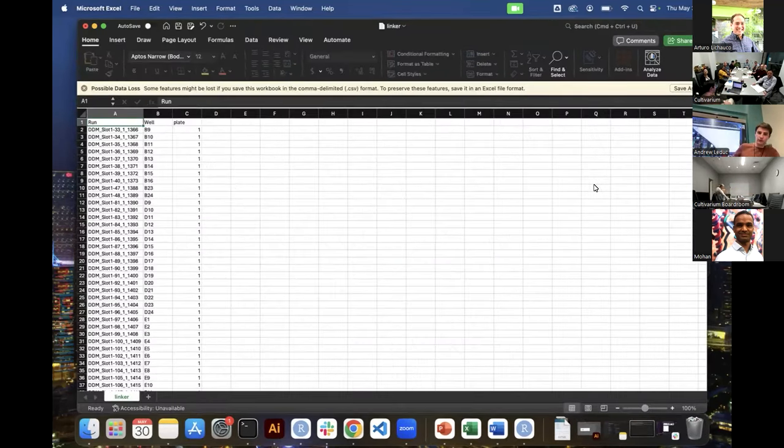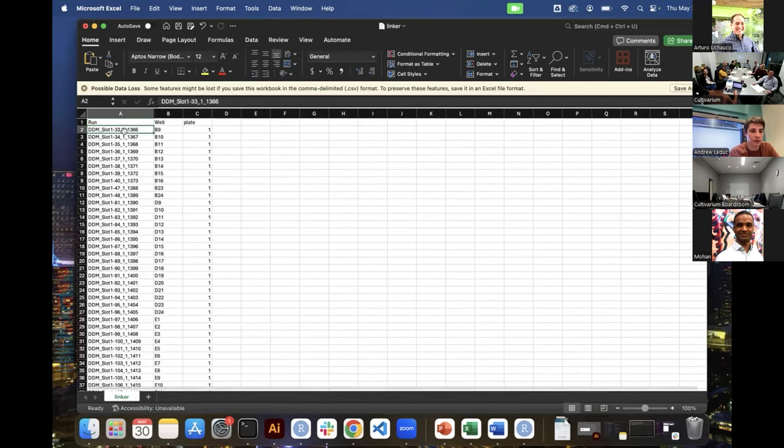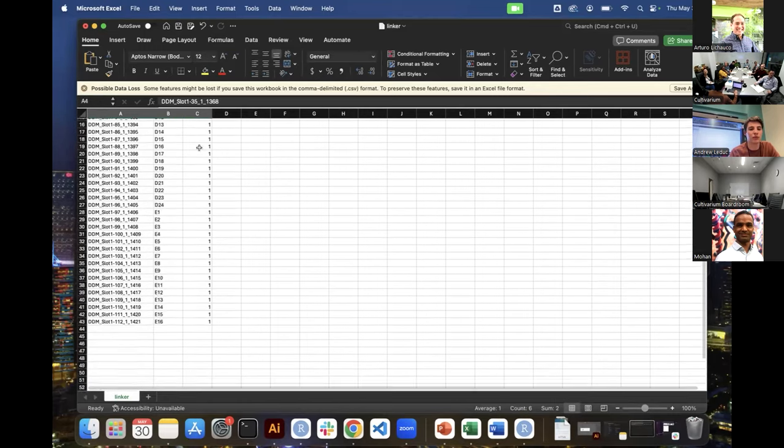Okay, so yeah, three columns: run, well, plate. And so these were the names. This is my first run. Everyone knows that these raw files end up having strange names. And then this sample was injected out of well B9, this sample out of well B10, B11, and so on. I think I only did one plate, so you can see this column is just all ones.